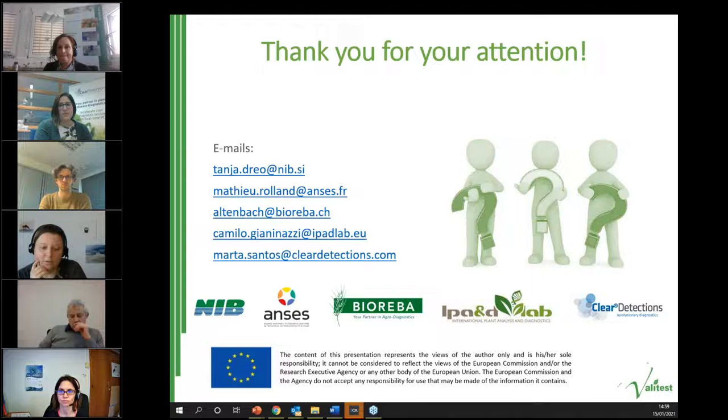But please, if somebody from the audience as well would like to, or maybe you, Ruth, who asked the question. Well, I do agree with what you're saying. What we in our lab are doing is transferring from ELISA to molecular testing. So we want to compare in our trueness experiment that our molecular assay is at least as good as our current standard method. One could say that that's actually what trueness stands for: compare it with your current method and see if it behaves the same or better. But yeah, one could also say that that is a verification.